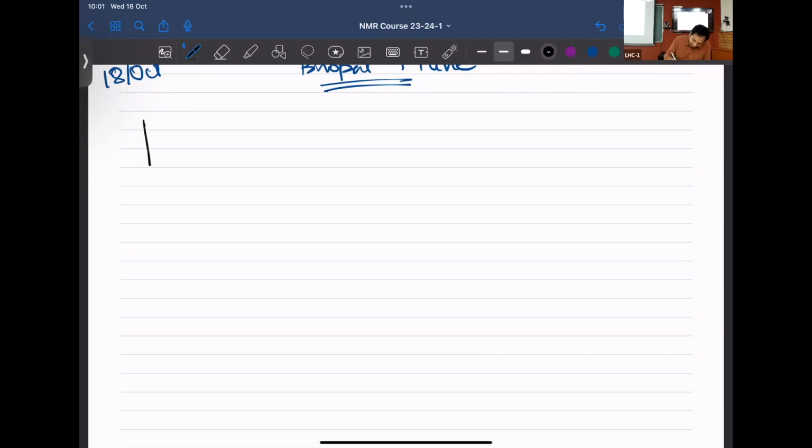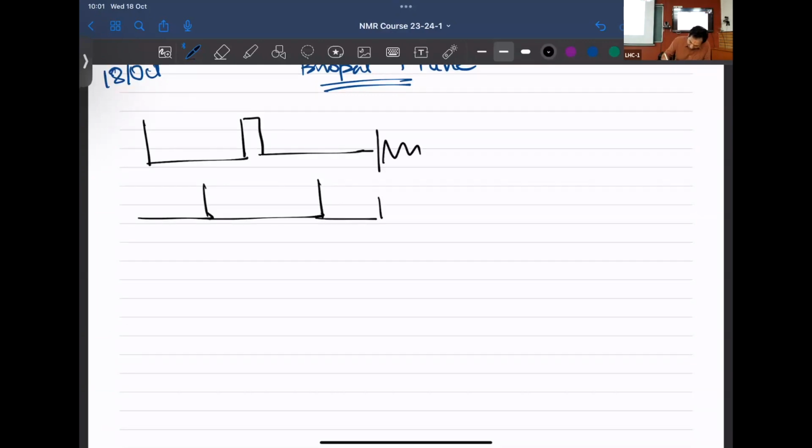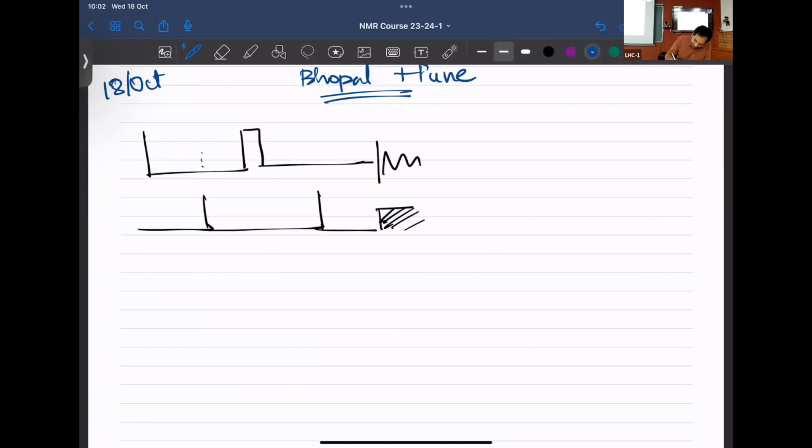Okay, I'm going to build up on the HMQC. This is the basic pulse program. From here on, I hope everybody gets comfortable whenever I draw pulses and delays of this kind. You had a tau delay on either side, and a 180-degree pulse is applied on the proton channel at the middle of T1 evolution. So basically, this is T1 evolution.